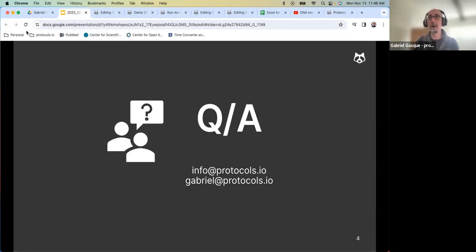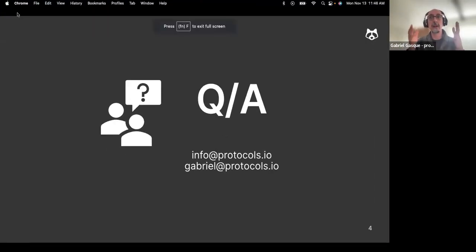So we have discussed advanced features of the editor, the file manager, and the workspace. So with that, I will stop now and I will take any questions if you have any.